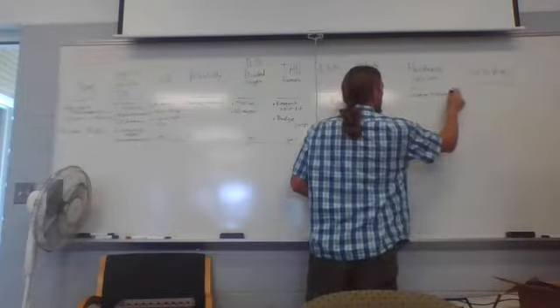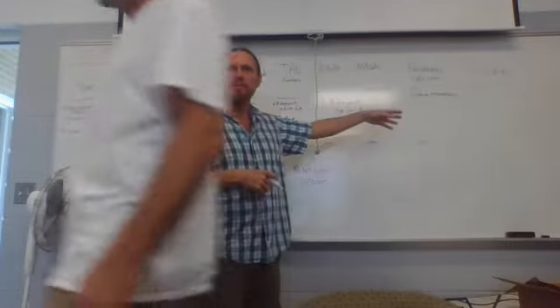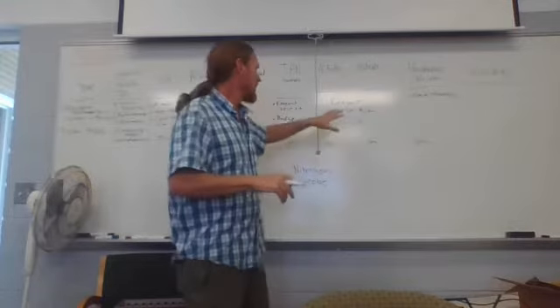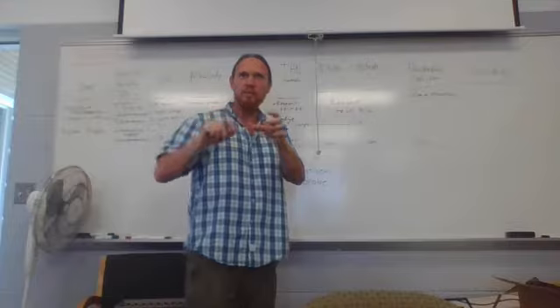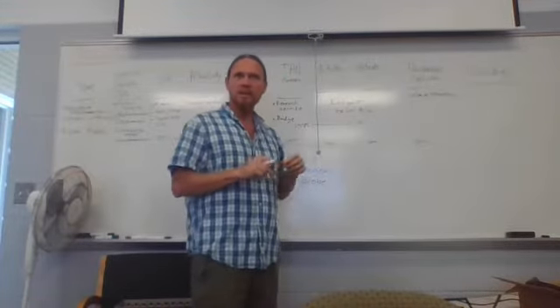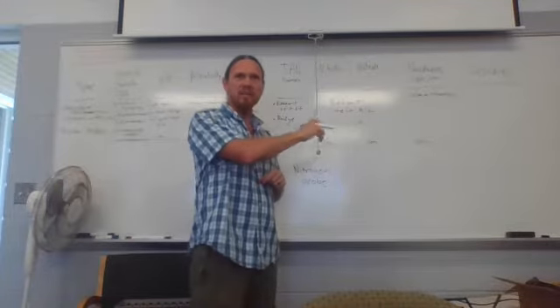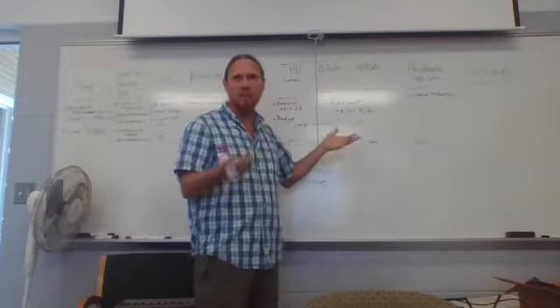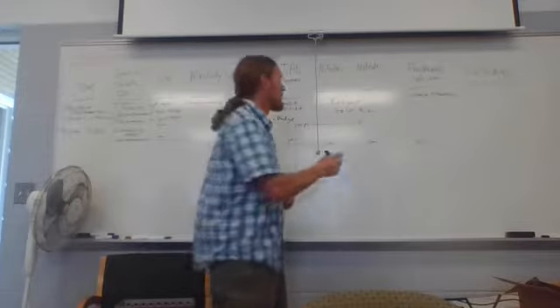Do you understand the difference between when we say a reagent test kit versus a titration? Both ways you're adding the reagent. In a normal reagent test kit, you're adding a measured amount of reagent and looking to match a color. In a titration, what you're measuring is how much of the reagent you have to add before a color change happens. So they're both chemical tests, but they work a little bit differently.